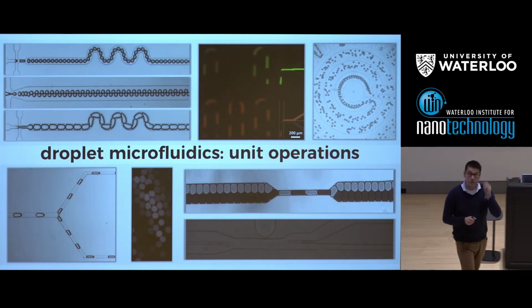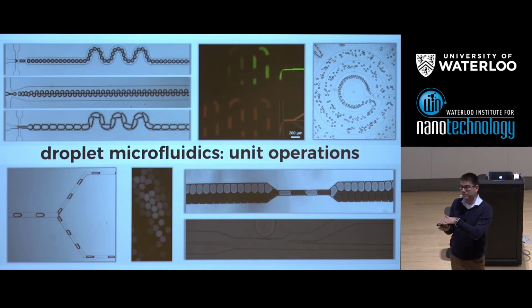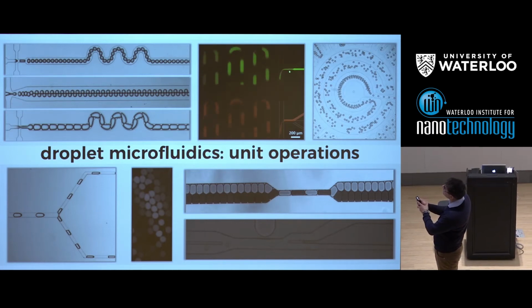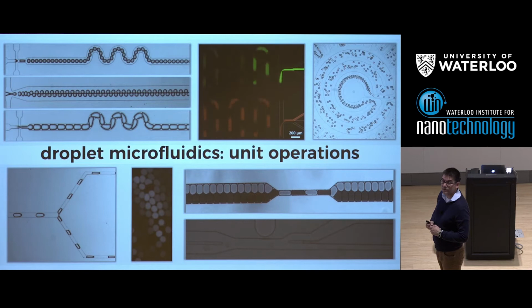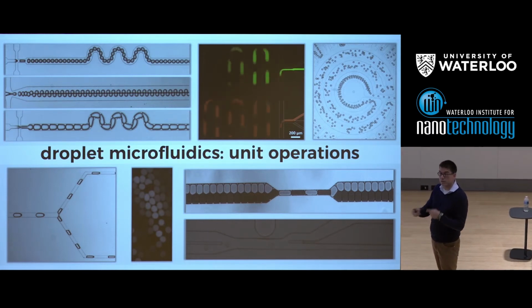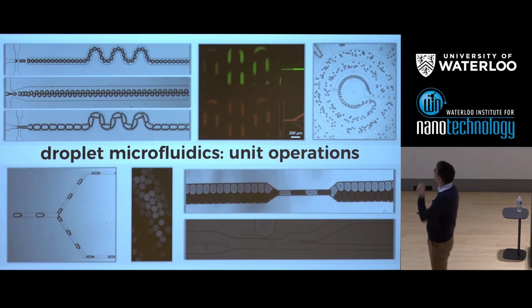But if you look at the green laminar flow, I'm actually varying the relative size or magnitude of that flow using a buffer stream, so that this laminar flow here is going to get thinner and thinner and thicker and thicker. And you can see that coming out here by a variation in the green fluorescence. So this simply shows that on a very, very fast time scale, we can controllably vary or dose what's going into each droplet. We can do other things.